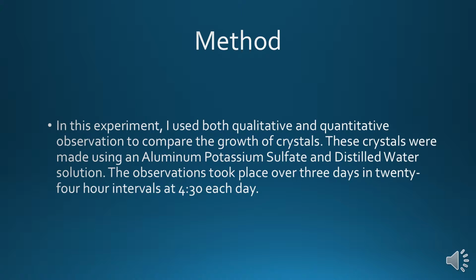In this experiment, I used both qualitative and quantitative observations to compare the growth of crystals. These crystals were made using an aluminum potassium sulfate in distilled water solution. The observations took place over 3 days in 24-hour periods at 4:30 each day.